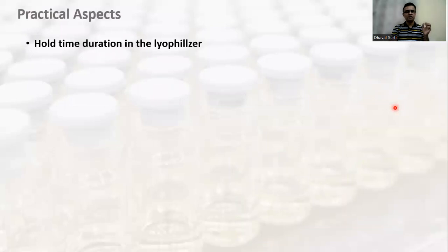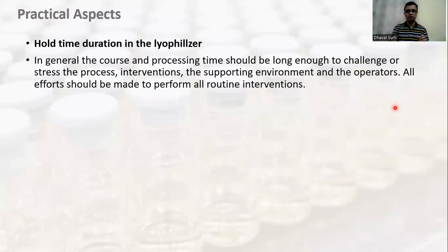Now, hold time duration in the lyophilizer. How long do we have to hold? In general, the process time should be long enough to challenge all the stresses: the process, the interventions, the supporting environment and the operators. All efforts should be made to perform all routine interventions.